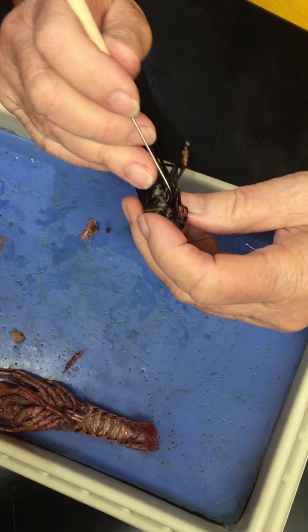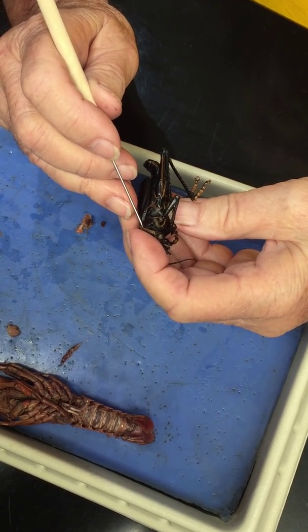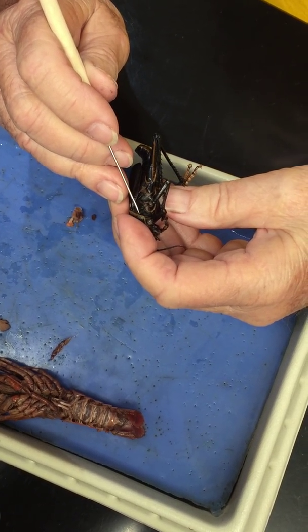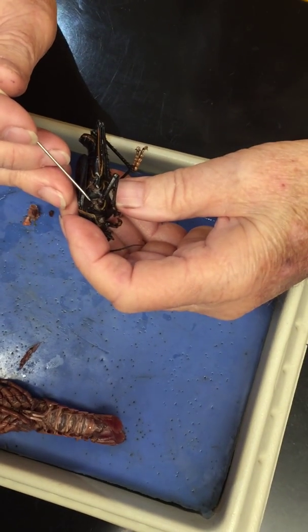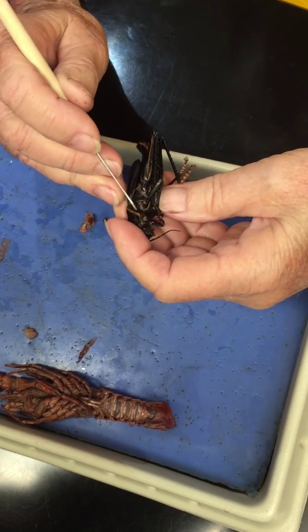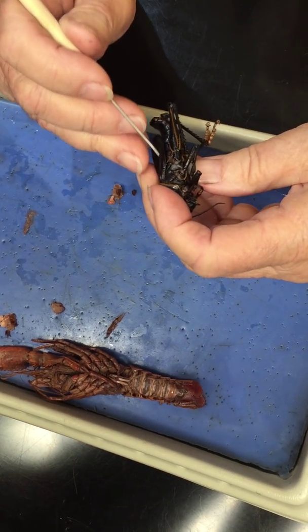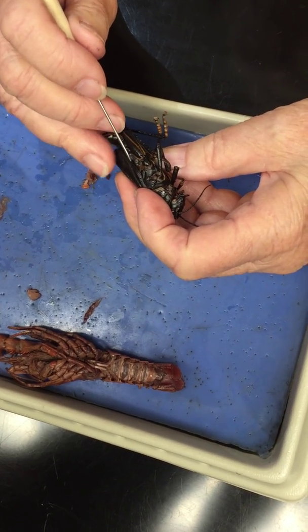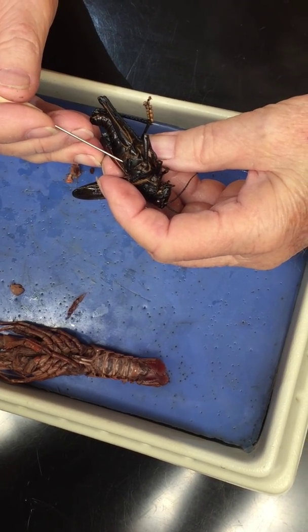There are, what's a hole that goes into the trachea? What is it? Look, there's a little hole right there. Oh, that's the mesothoracic spiracle. Just up under the edge of the pronotum here. This one doesn't. Can't get it up very well. Is the prothoracic spiracle. Right here is the metathoracic spiracle. Right behind the metathoracic spiracle is the tympanum, the ear.